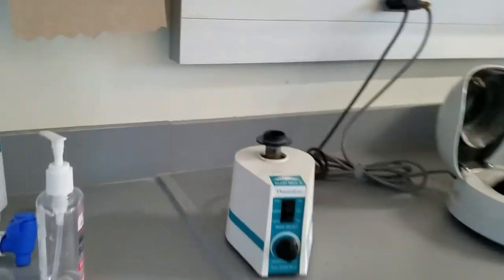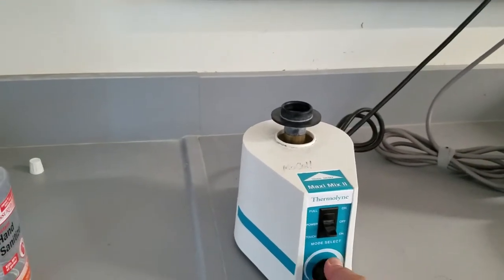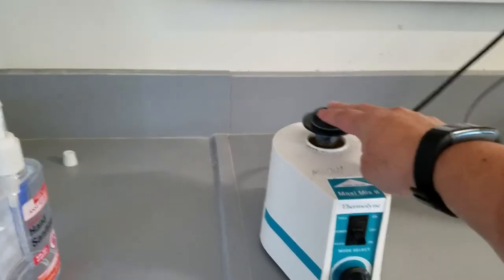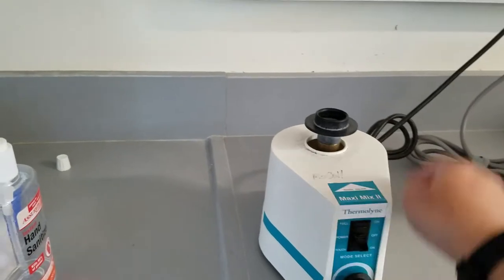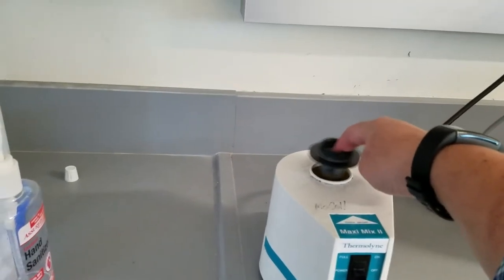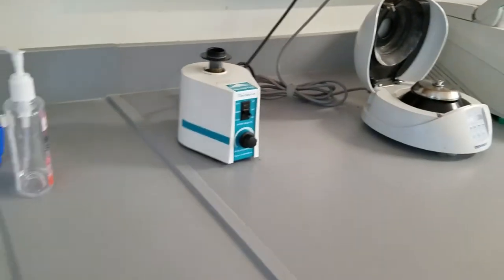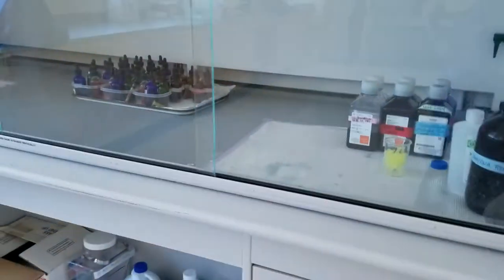Also over here is a vortex, it's called a maxi mix. You can change the speed and when you put your stuff on there - a tube or something - it basically mixes it at a super high speed so that it can make a homogeneous mixture or a suspension.